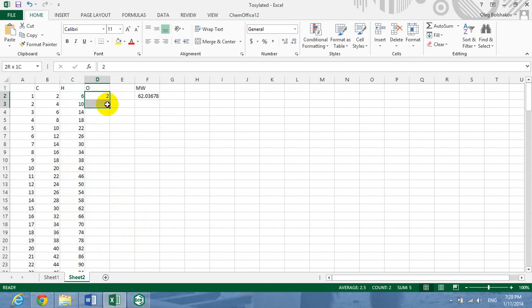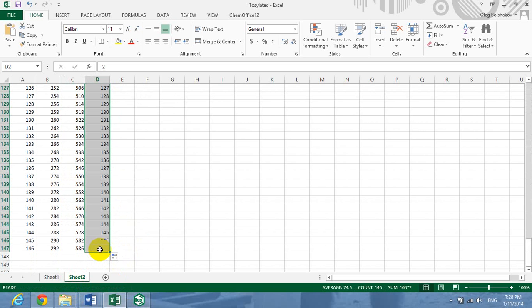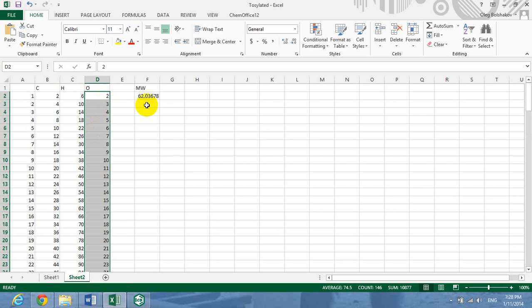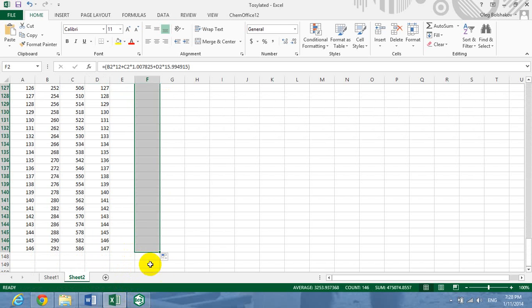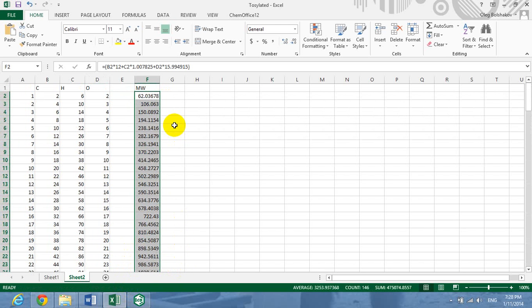And any ethylene oxide unit is going to make the molecule one oxygen atom heavier. Subsequently, you drag the molecular weight of the ethylene glycol and get the exact masses of the polyethylene glycol molecules.